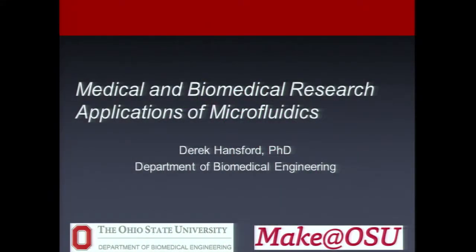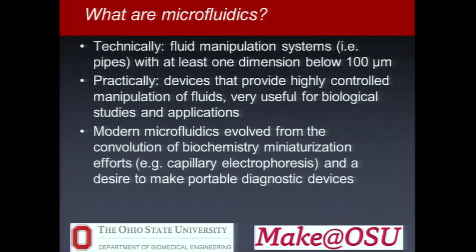Today I'm going to talk about microfluidics, specifically applied to biomedical research and to medicine. So I'm going to walk first through what is microfluidics, and then go through some examples, and then just talk about what resources we have here at OSU for fabricating those. I also have some samples sitting back in the back corner there that we can talk about at the break if you're interested in finding out what these look like and how to play around with them.